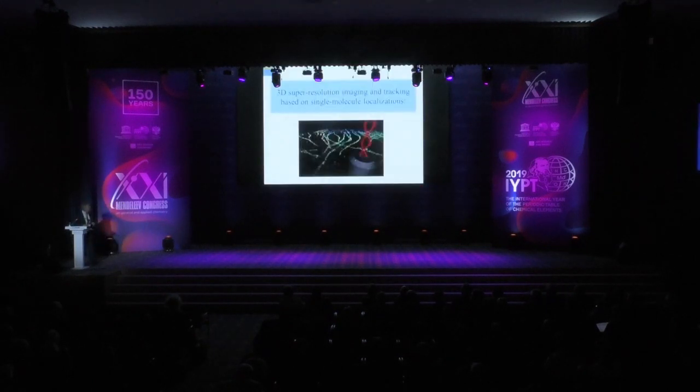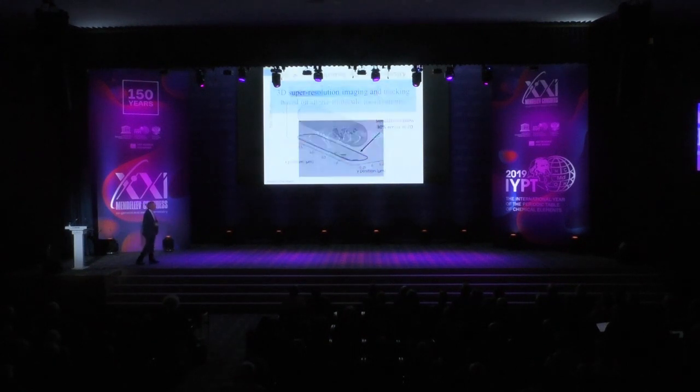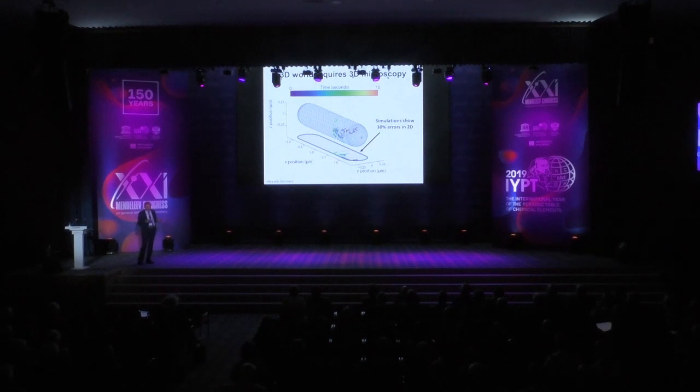So now, I want to talk a little bit more about one special aspect of these experiments, which is 3 dimensions. We'd like to be able to do all of these imaging tricks, including the Z dimension, not just X and Y, because you know the answer. The world is 3-dimensional, right? It's not 2-dimensional. If I'm trying to study some property like the motion of this transmembrane protein on the surface of a bacterium, but I can only observe it in 2 dimensions, you see that I only observe part of the motion, and miss a lot of the motion.